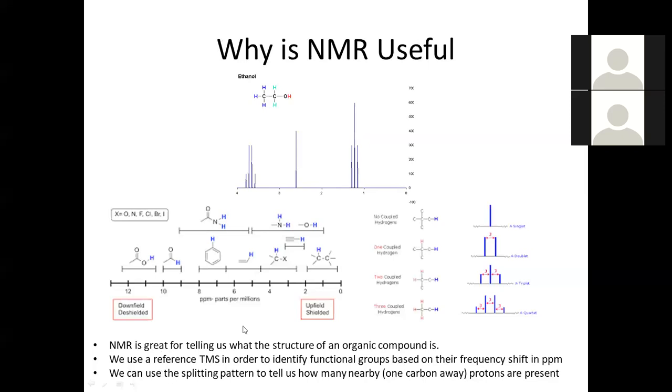So the first thing you want to do is label the equivalent hydrogens in these molecules. For this, you can see all three of these dark blue hydrogens that are labeled here on this methyl are equivalent. They have the exact same electric field, magnetic field around them as each other, right?